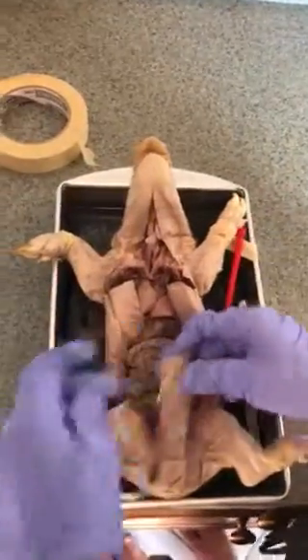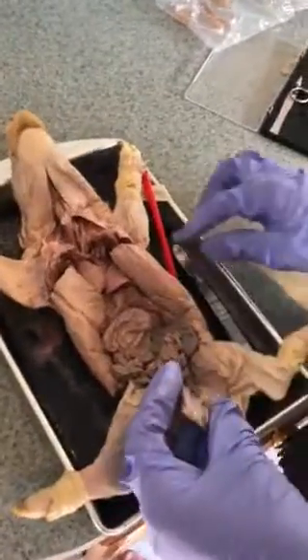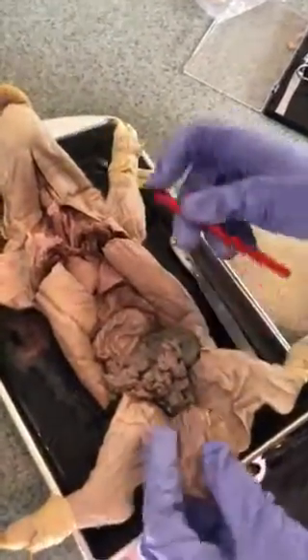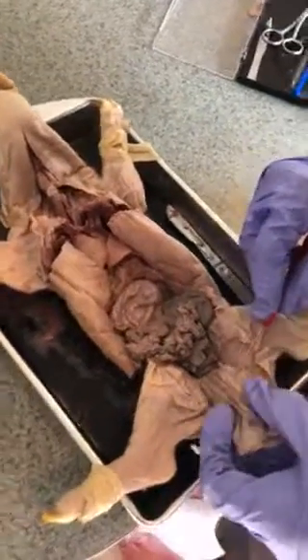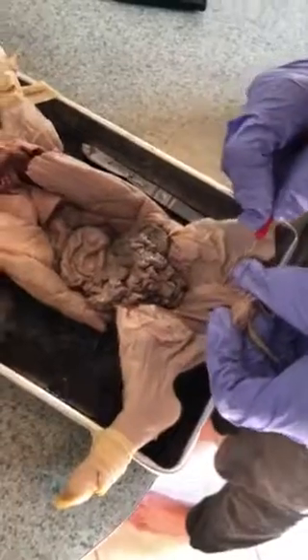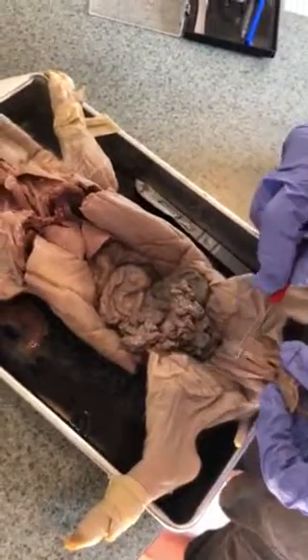We need the umbilical cord, which is right here, and the umbilical arteries. So here's the umbilical cord. The umbilical arteries are on either side of the fetal pig's bladder. So we got one umbilical artery here, and we have the other umbilical artery here, and this is a bladder.